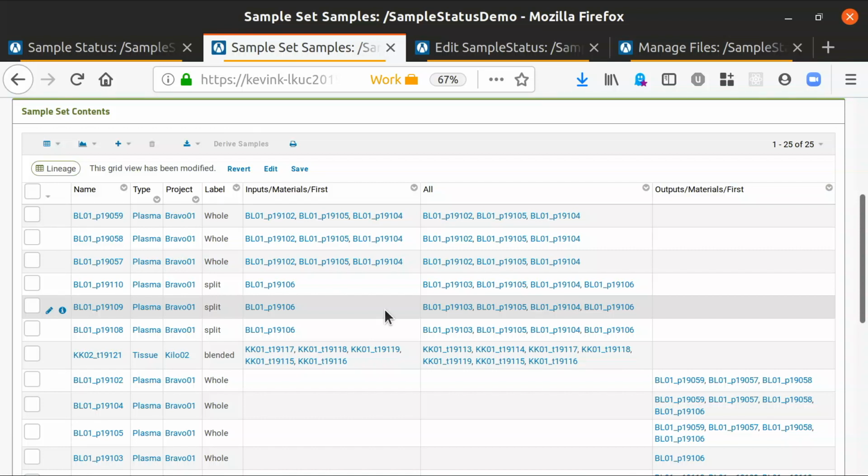Do we want to say anything more about specimens? Specimens are very much tied to studies right now. They've got a lot of constraints: you need a specimen ID, a time point, and a participant, and vials and events come in. Sample sets are a little more open. You can add fields and configure them how you like. But there's no vial parent specimen relationship within sample sets inherently. There's just a sample row. So they're slightly different things, and one of our long-term goals is to reconcile the differences between the two.